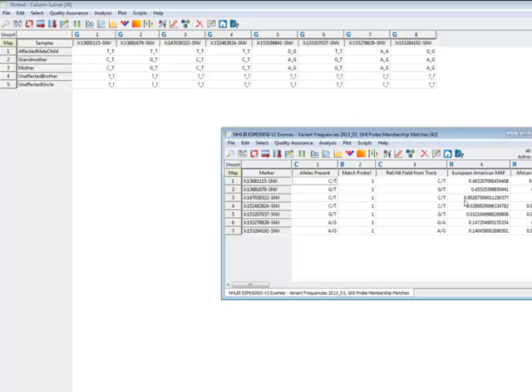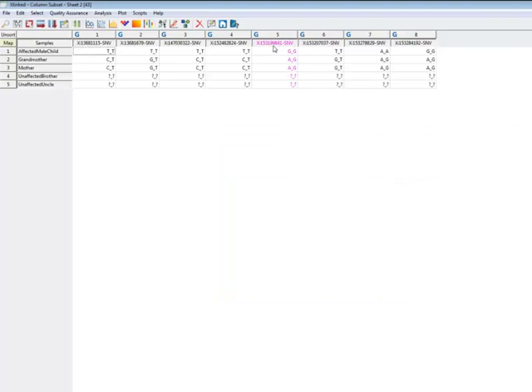But obviously there's one missing. Okay, so one of these up here has never been seen in NHLBI, and I can just eyeball it and know it's column 5 up here. It's this one that is not there. I could also cross-reference between the spreadsheets and highlight that column, but I already know which one it is.